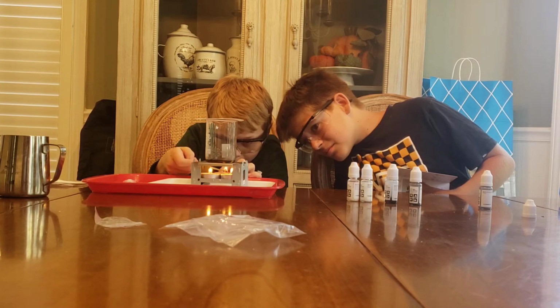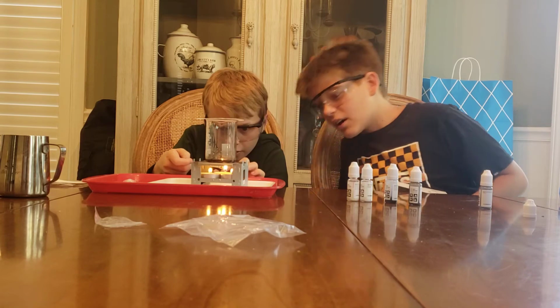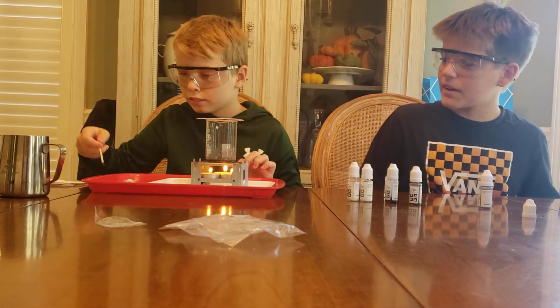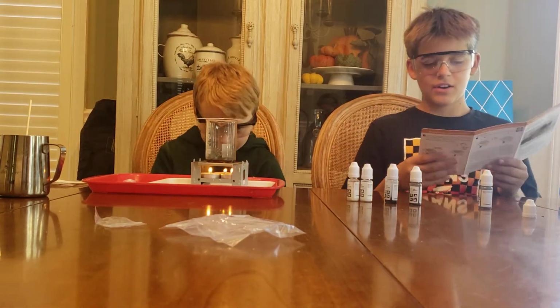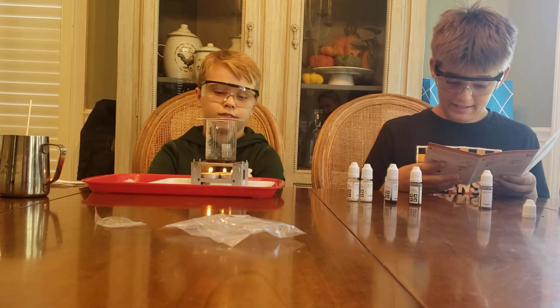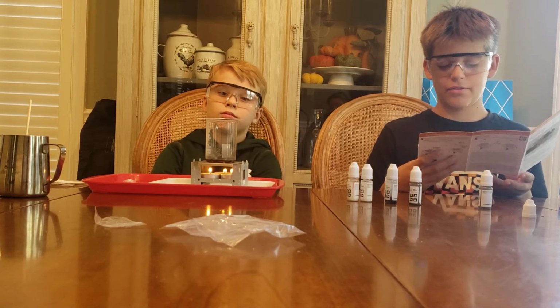It looks like, I think we have to, okay, you got all of them, dip it in the water. Oh, dip it. Keep it in there, keep it in there. Okay, so do not inhale the emergent gas. Wait about 5 minutes.